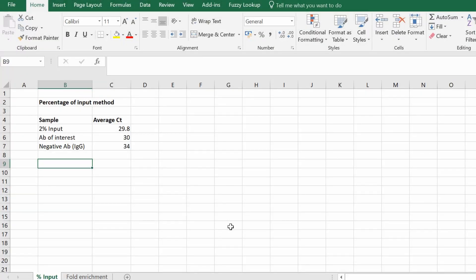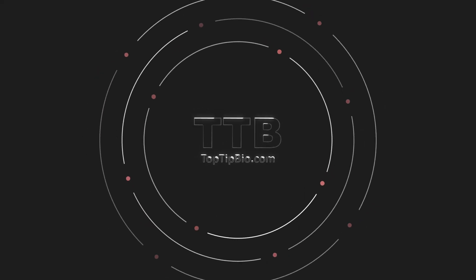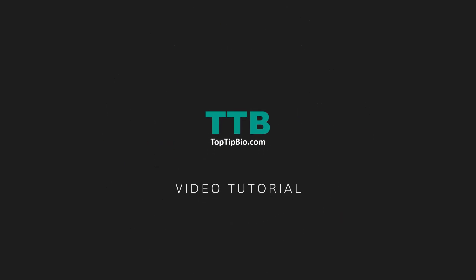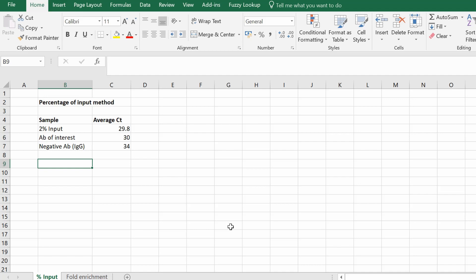In this video tutorial I'm going to show you how to analyze ChIP qPCR data to calculate the percentage of input and fold enrichment. Let's start off with the percentage of input method. For this method you need to have three things: an input sample — commonly a 2% or 1% input sample — an antibody of interest sample, as well as a negative antibody sample.